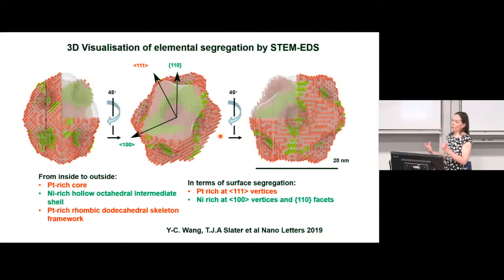So generally what we get when we do electron microscopy is a two-dimensional image of a sample. I'm not going to focus on three-dimensional imaging. I just wanted to mention that we also can do three-dimensional imaging by taking lots of two-dimensional images and combining them a bit like they do in an X-ray CT scan in order to get a three-dimensional elemental map.